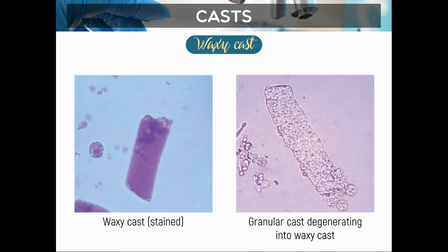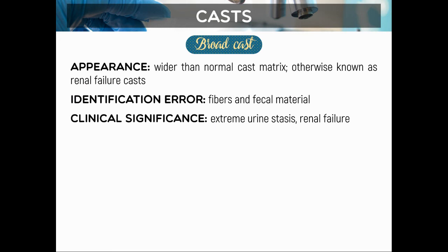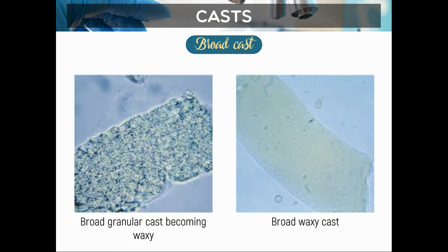The broad cast is wider than the normal cast matrix, otherwise known as the renal failure cast. The clinical significance is extreme urine stasis or renal failure — when urine stays in the tubules, the tubules enlarge, and the resulting casts are correspondingly wider. Here we can see broad waxy cast and broad granular cast examples.